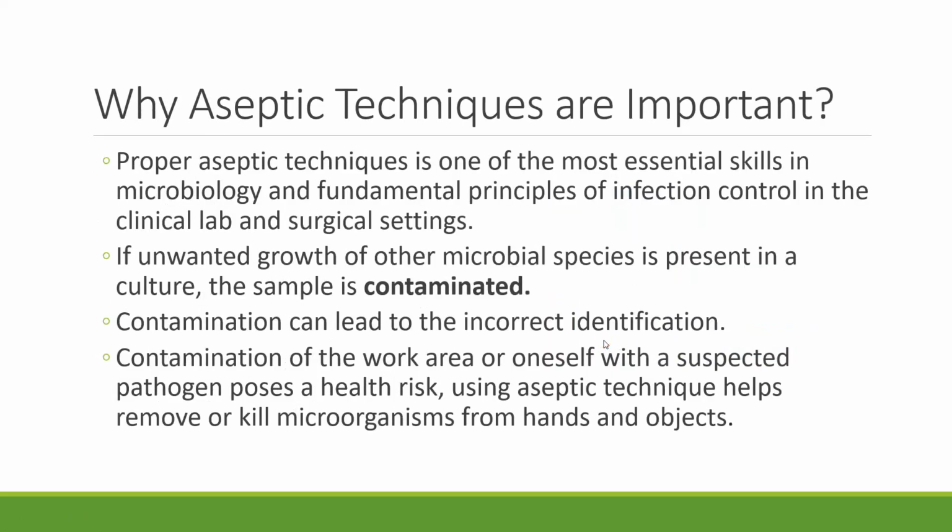So why then, if we're trying to grow microbes in lab, is aseptic technique so important? One is because, as I already mentioned, it's an essential technique for microbiologists. But it is this aseptic technique which serves as fundamental principles for infection control in clinical lab settings, in patient rooms, in surgical settings, etc. So you need to understand the principles of aseptic techniques, not only for this class, but for your future in the healthcare field.